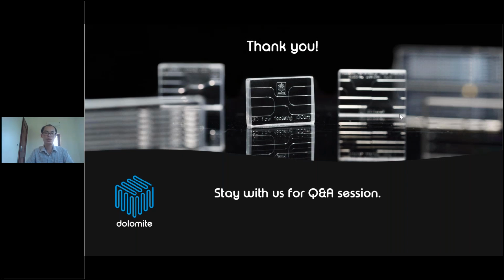As I mentioned, it's very popular and you can find references in the literature. Normally people use a drying process, simply an evaporation process, for example in vacuum condition to reduce the vaporization temperature.